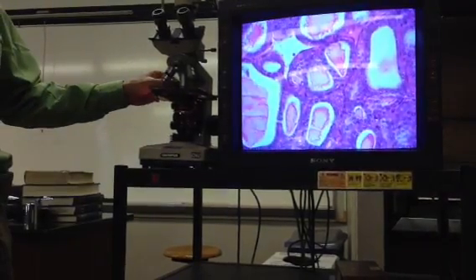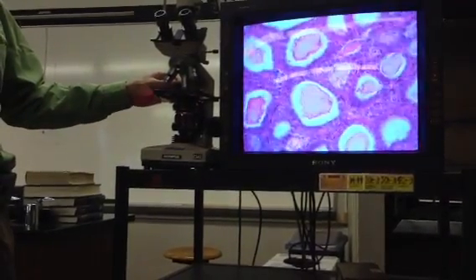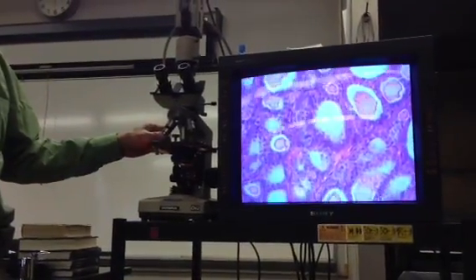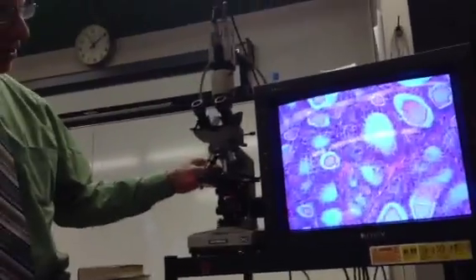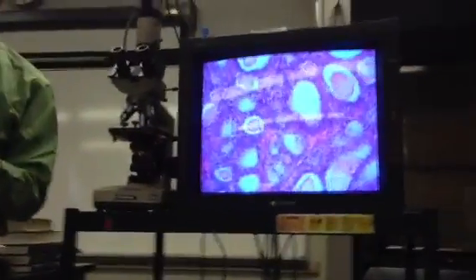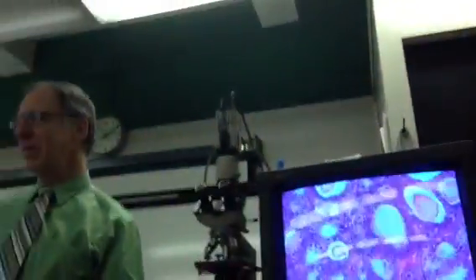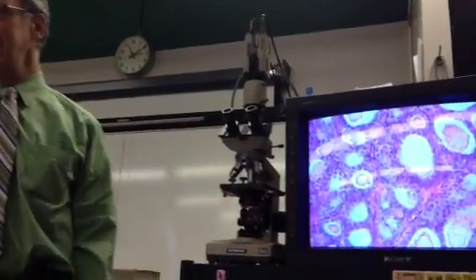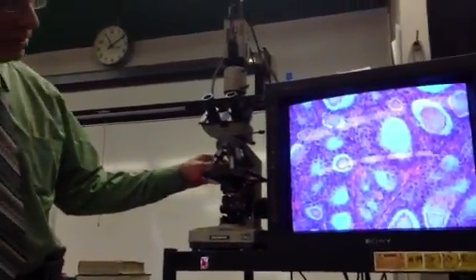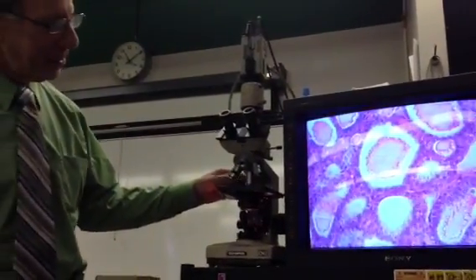Usually what I do is the questions are drawn in advance, like what kind of cell type, what kind of hormone, and all of that. Then when I actually get the slide, if something strikes me, like if I see this very obvious parafollicular cell, also known as a C cell or a clear cell, that jumps out at me, then I might ask about that. That was the clearest one that I saw there. And there are a couple of others here.